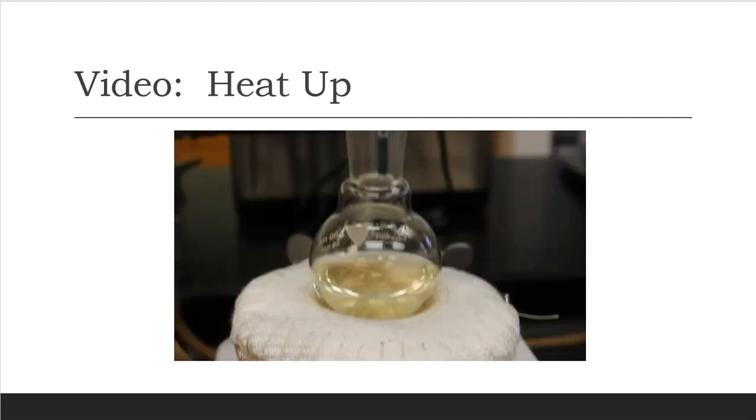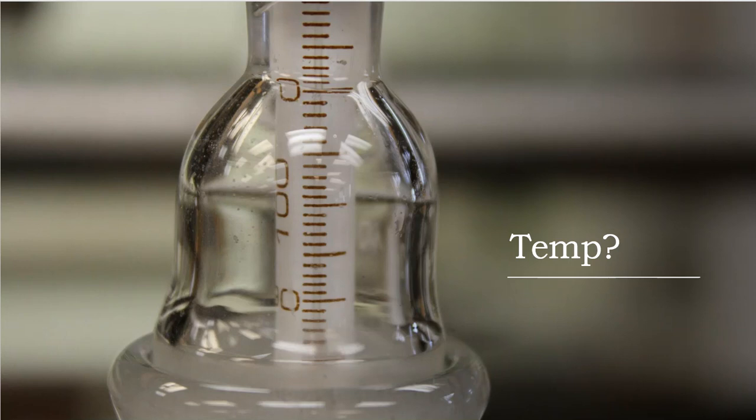Okay, so up here at the very top of the sidearm, you're going to see a thermometer adapter. Right now, it's before it started to heat, so I'm not expected to see any kind of rise in temperature here at all. So I just wanted to take a picture to prove to you that it was not heated at this point. Everything was at room temperature, and over time, this is going to creep up and up, and we'll be able to read some temperatures off of this as our stuff begins to boil over.